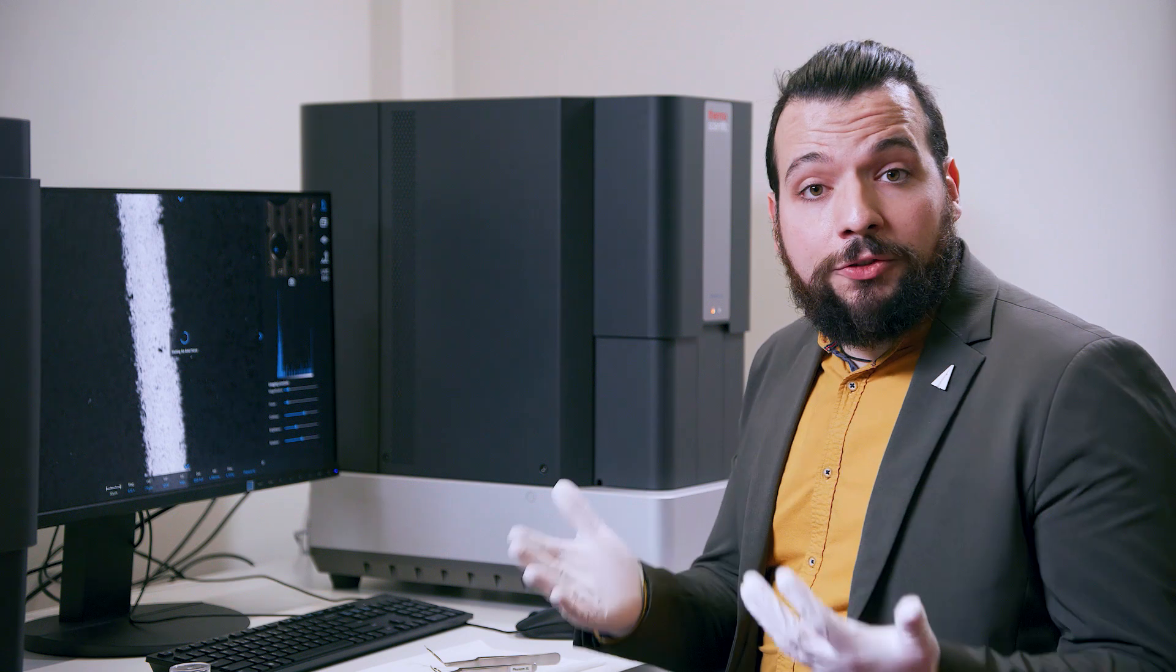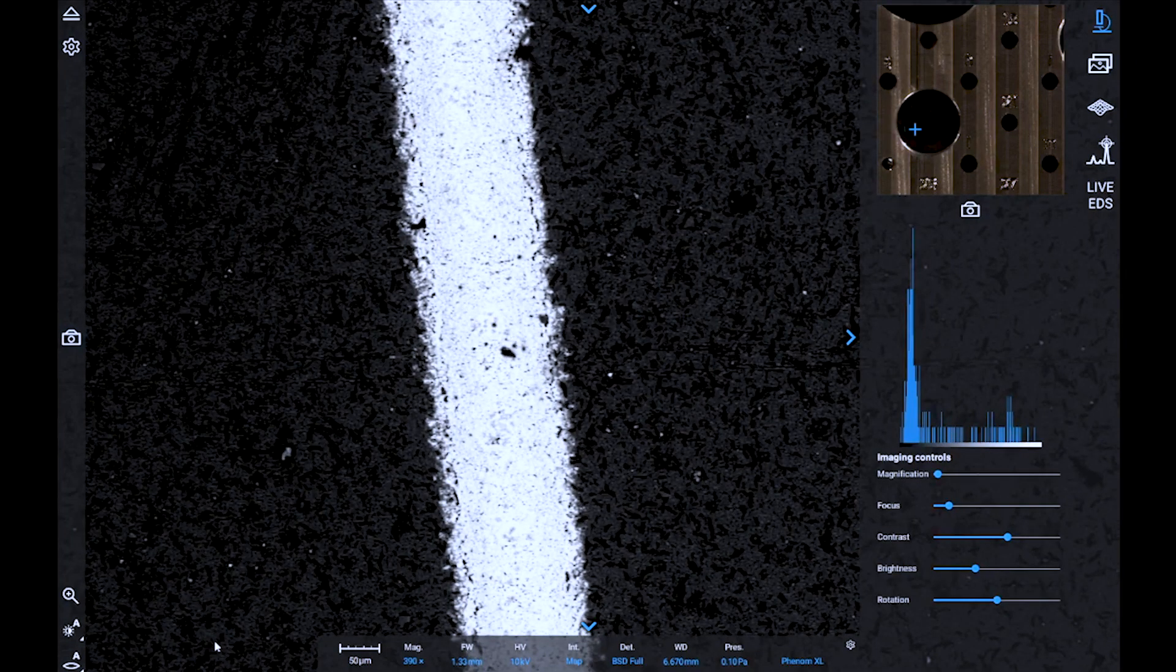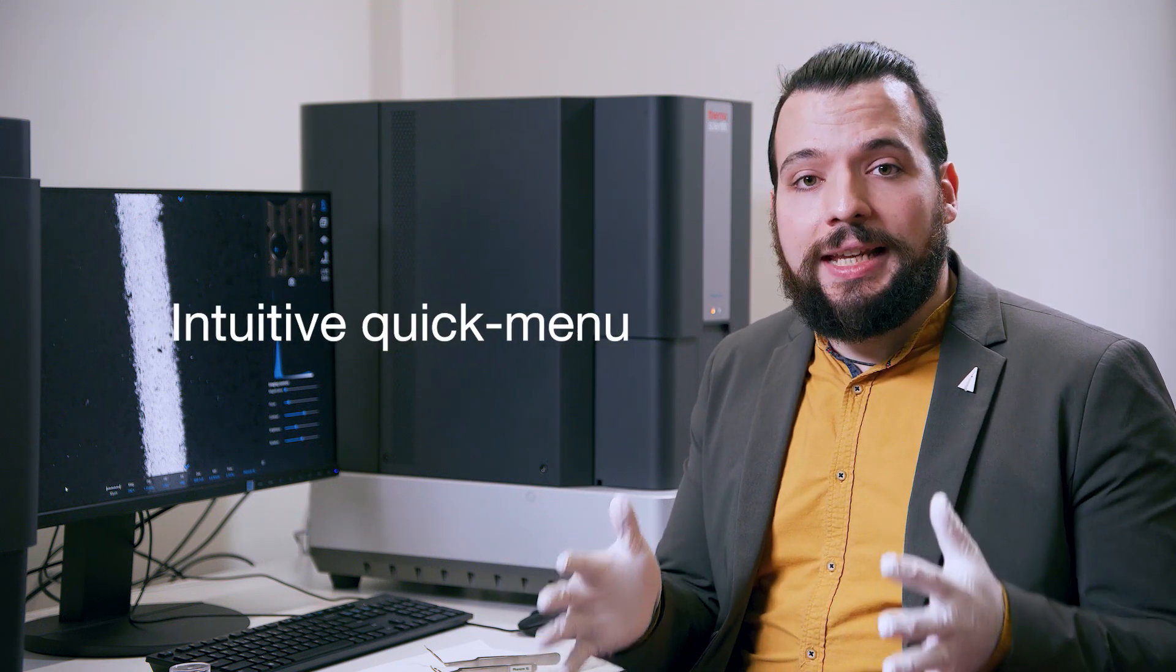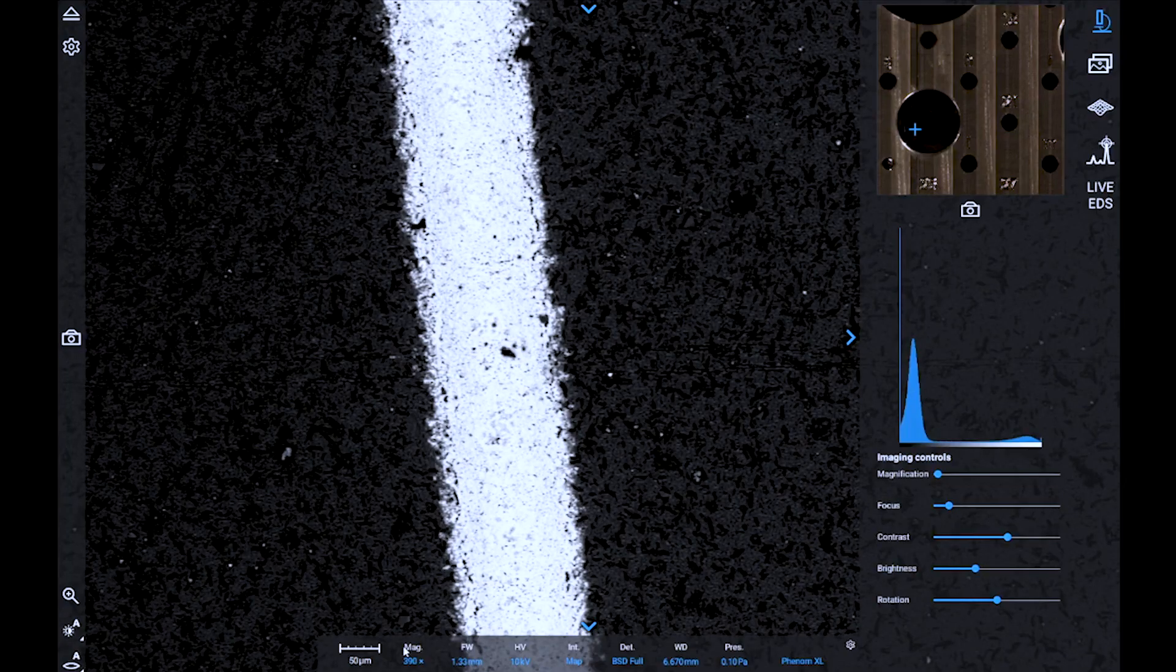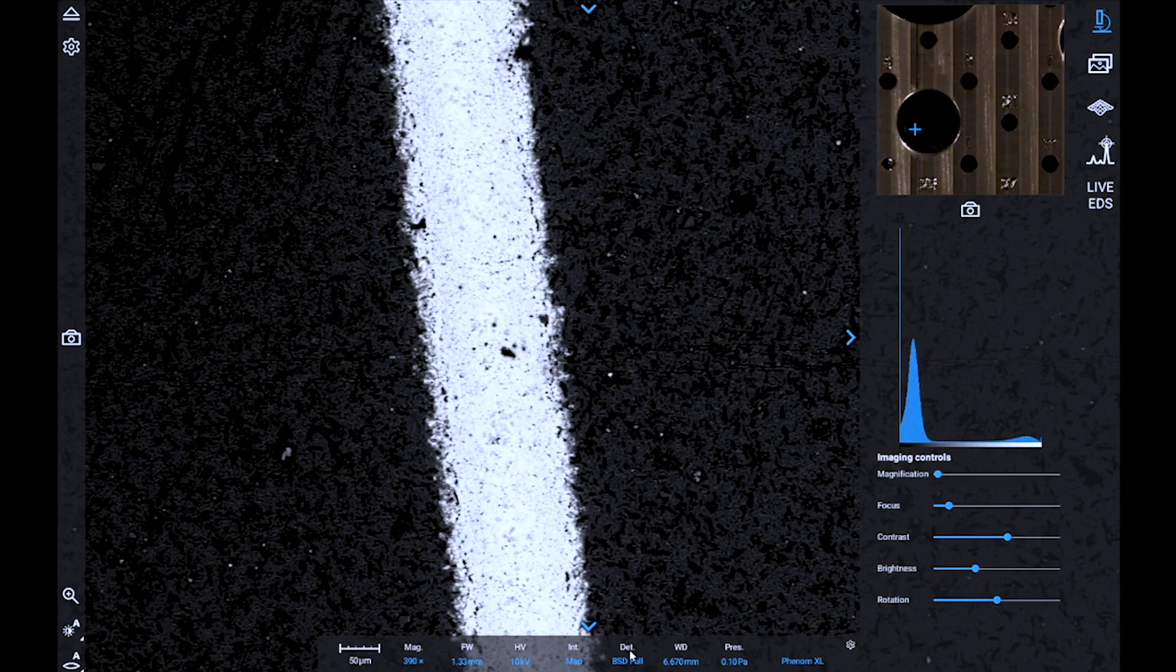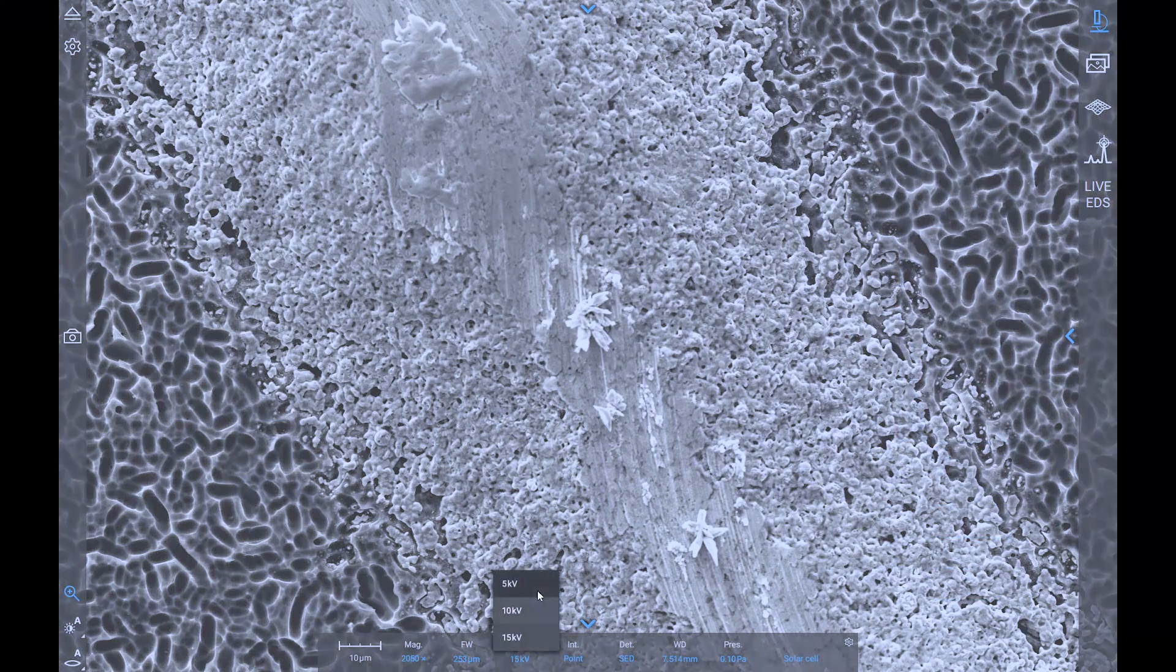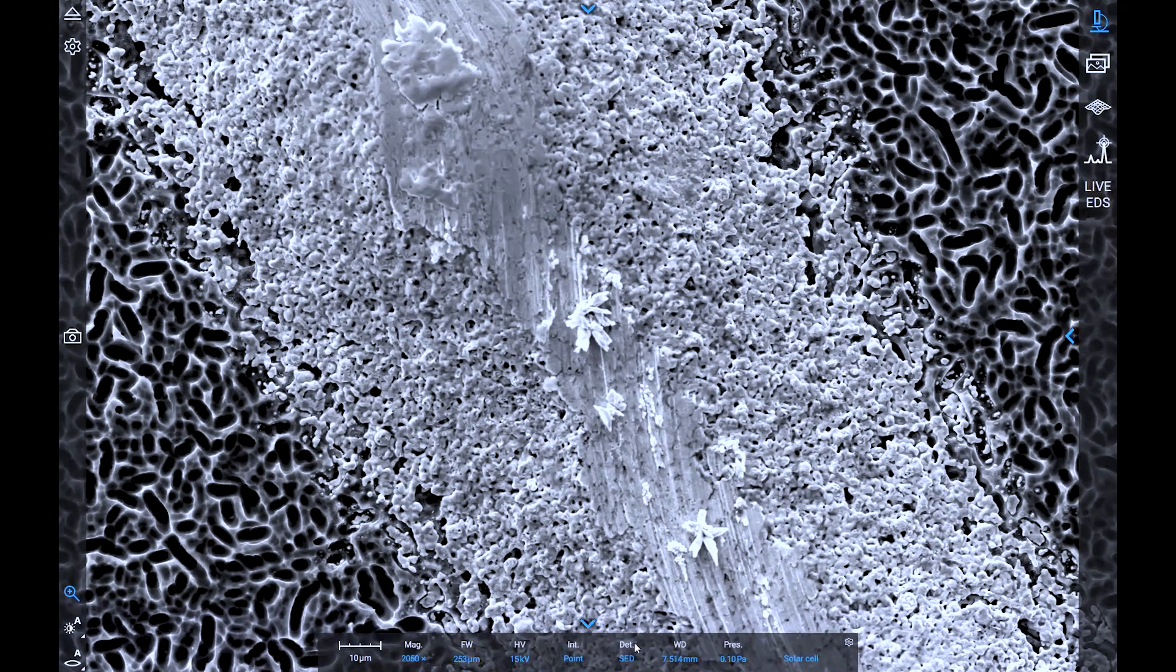Or, if preferred, you can switch to the manual functionalities. Settings such as voltage, current intensity, or magnification are easily adjusted directly from the data bar. In the bottom part of the screen, you see the magnification, the voltage, the current intensity, and the detector used for imaging. By clicking on these values, we can actually quickly select a different preset value.